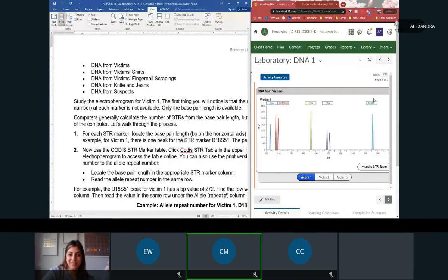Kinda, yeah. Okay. I know it looks a little confusing, but really what you need to know is that when they were looking through the blood, this is the couple of instances where they're able to say, okay, this is clear enough that I can use this to compare the DNA from blood from other people. Then we're going to look at all the same genetic markers, all the same genes, so that we can compare it. You can use different markers, different genes, but this is the one way that this forensics scientist looked into the information. So, does that make sense so far?